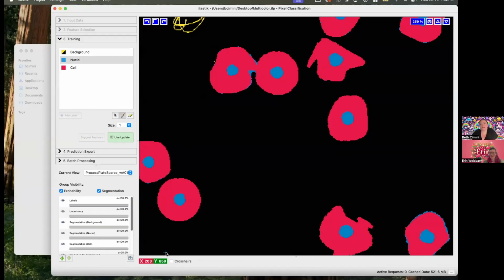Couldn't have summed it up better myself. Sorry if I took the words. No, no, you were going perfect there and I jumped ahead. I just got excited. Good image analysis is always exciting.